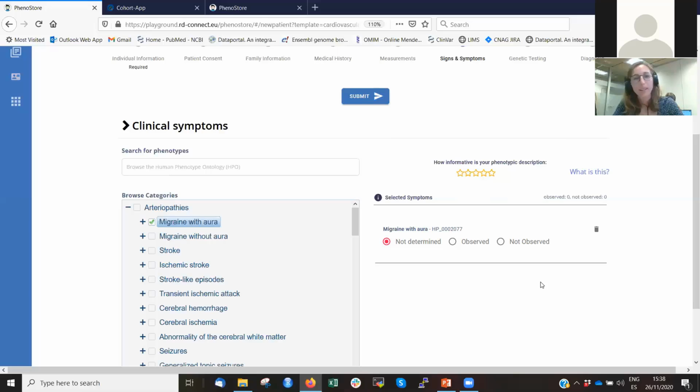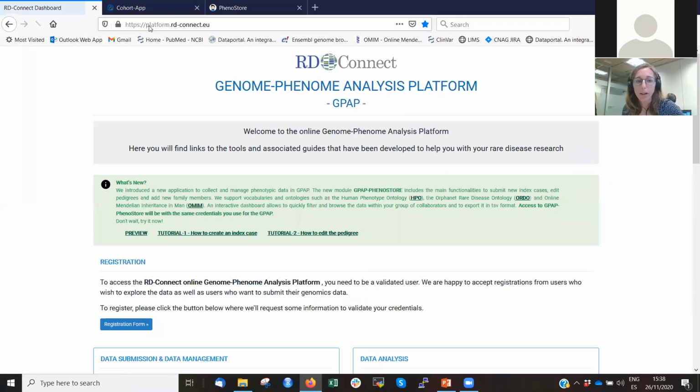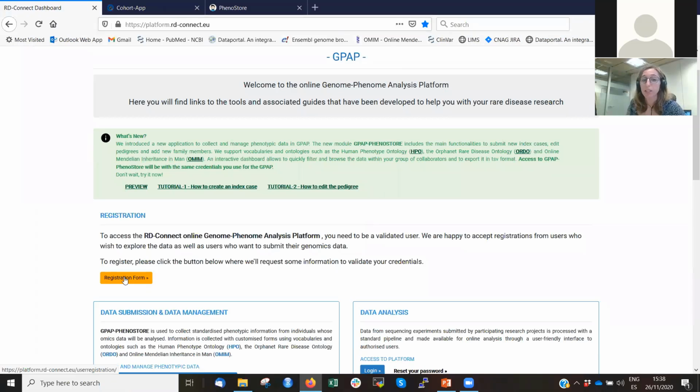Okay, thanks. We have a question from Andrea also. How do we get a username and password? For that, you will need to register to the RD-Connect Genome Phenome Analysis platform if you are not registered yet. Otherwise, with your credentials, you are able to access Phenostore, as now we have migrated all the data from one system to another. So anything you have entered before in the Phenotypes instance is now available here in Phenostore. But if you'd like to register, then you will need to access the main platform page, and there you have links to register to the system.